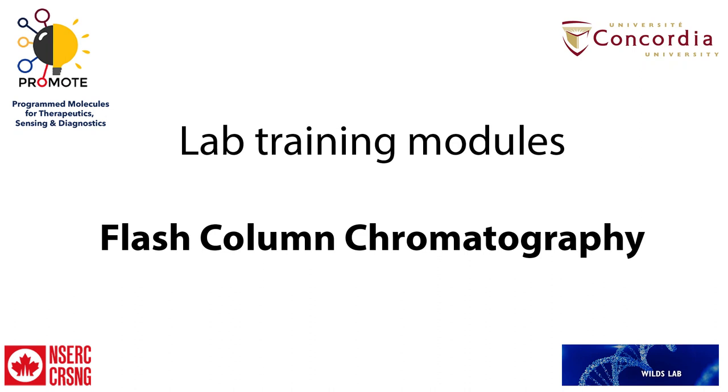This video is made to give a brief overview of the manipulations involved in flash column chromatography. The technique's goal is to purify a sample mixture using a combination of stationary and mobile phases that run through a glass column.